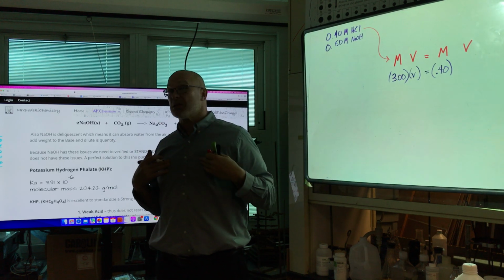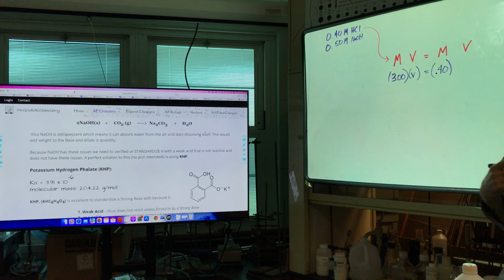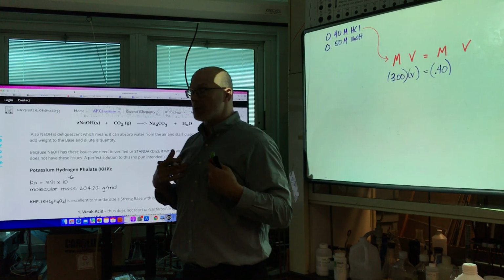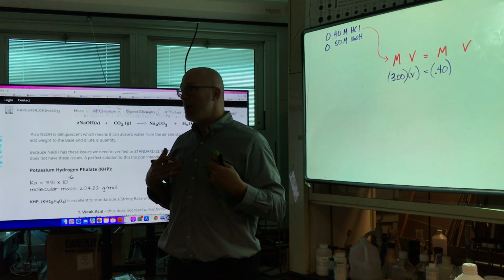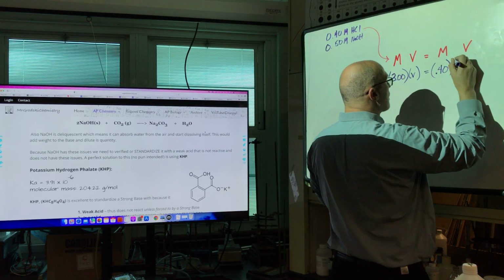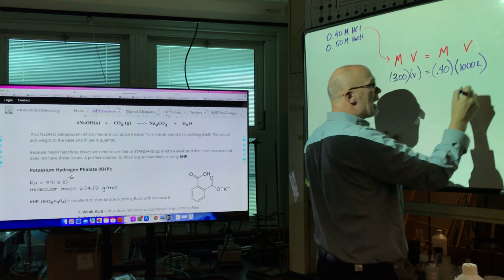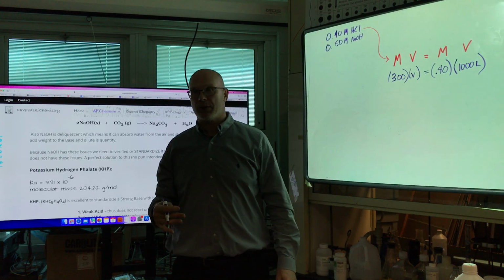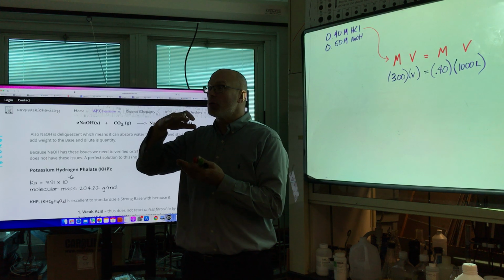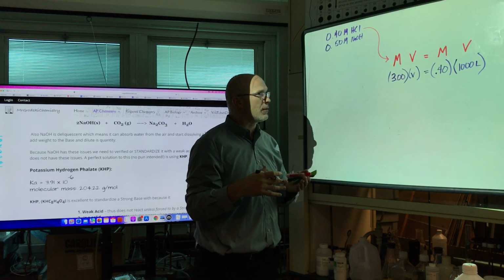Now for me, this is going to be different when you make your own lab. For me, I want to make enough for all the labs for the 2 classes. So I'm going to make 1,000 milliliters. Okay? So I'm going to write 1,000 milliliters. Now, for your next lab, you're going to make 100 milliliters. There's a reason for that. You have a 100 milliliter volumetric flask. I'll talk about that. So let's solve for this.